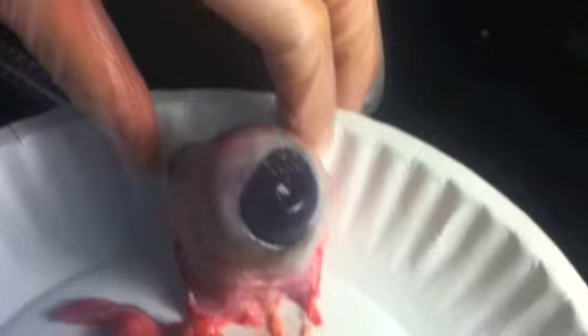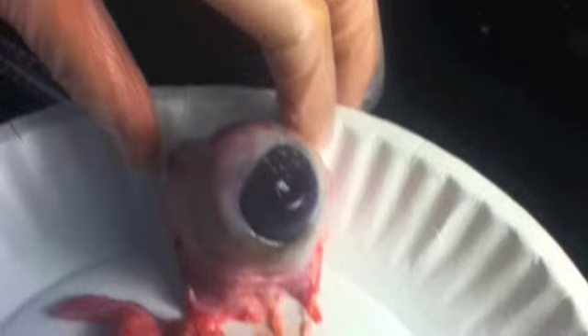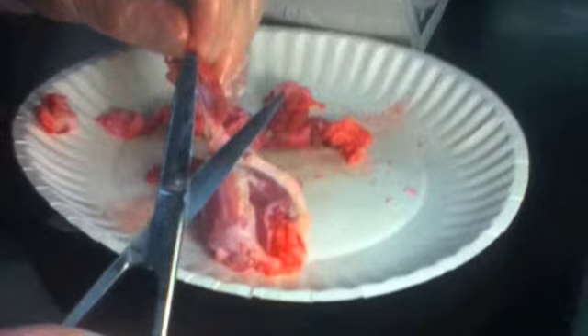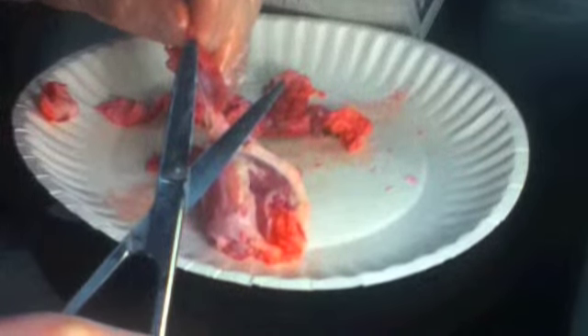The cornea is a clear transparent layer formed from the sclera. The front section acts as a fixed lens and begins the focusing of light on the retina. To dig deeper into the eye, we need to cut through some fatty tissue. This can be done with scissors or with a scalpel in hand.